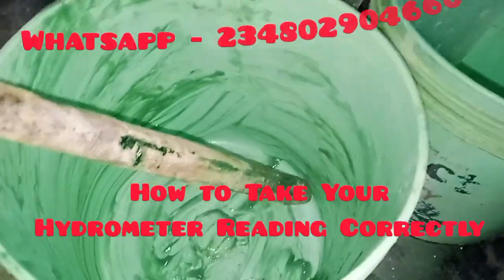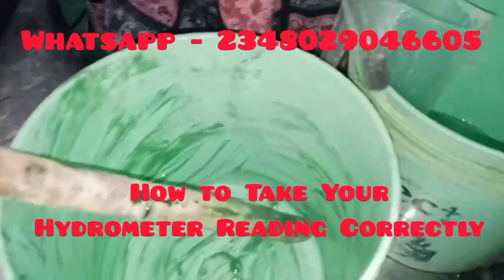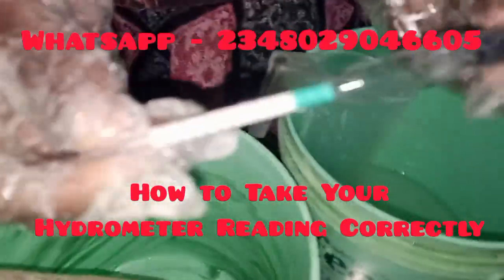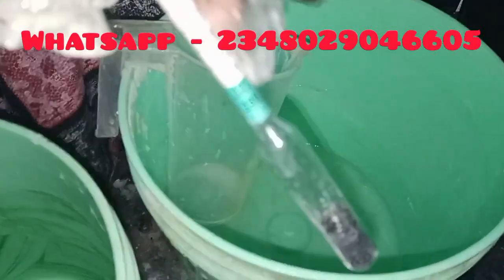Welcome to today's training session. Today we'll be learning how to measure correctly with our hydrometer and how to take our hydrometer reading correctly. This is a hydrometer. It is used to measure the chemical concentration of a chemical solution.